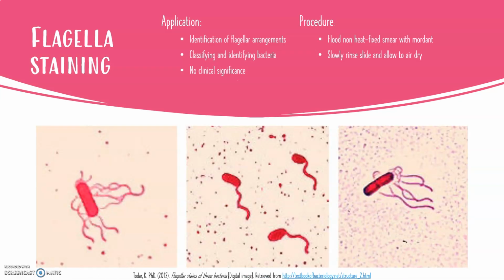For the flagella staining, flagella are tail-like structures that some organisms use to move from one place to another, and they're so thin that they're not visible without this staining technique. The flagella staining technique coats the flagella with stain until they're thick enough to be visualized. Although this stain has no clinical significance, visualizing flagella gives us the ability to classify and identify bacteria based on how many flagella are present and where they are on the cell body.